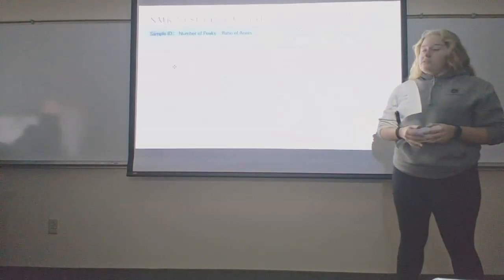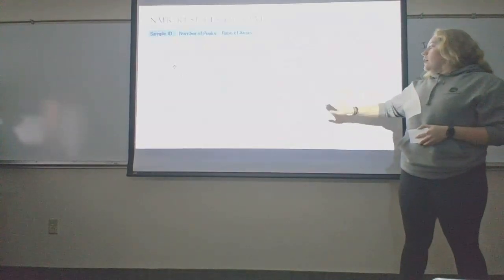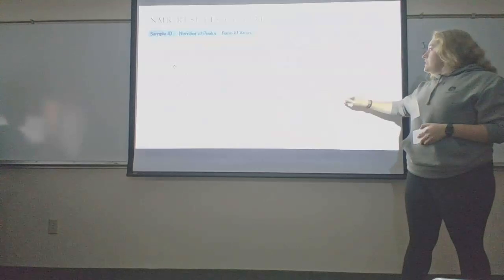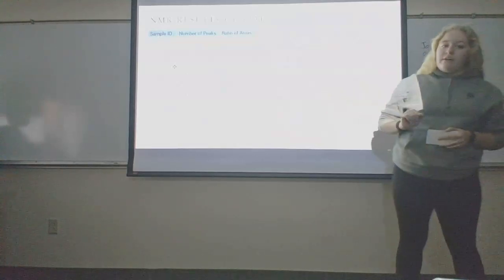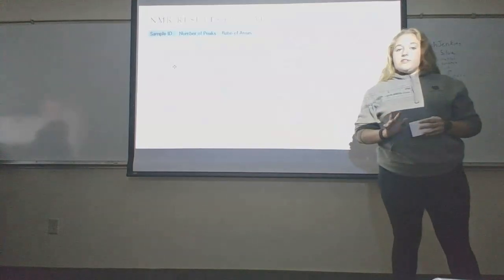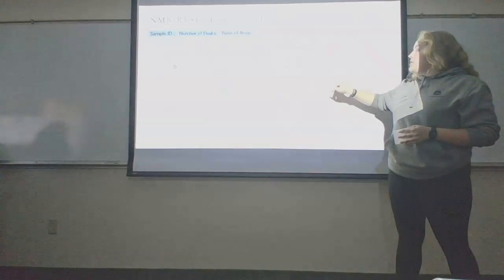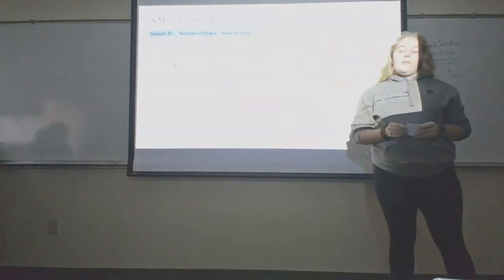For the NMR results, this is a graph that occurred. There are obviously 2 peaks. One of them has an area of 1 underneath, and the other has an area of 1.5 underneath. This means that there are 2 types of hydrogen present. We actually doubled the area underneath so that when we found the ratio of areas, we could be working with full numbers.